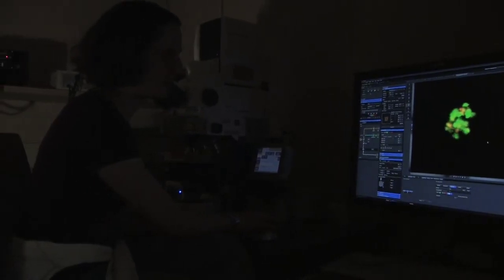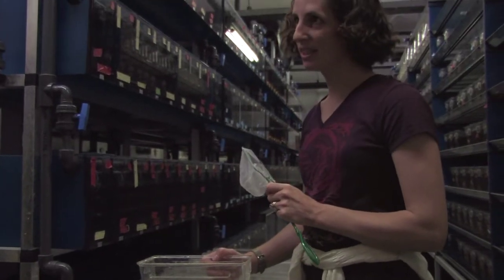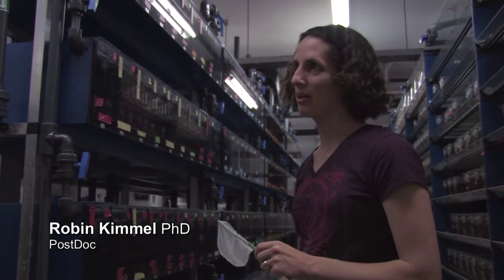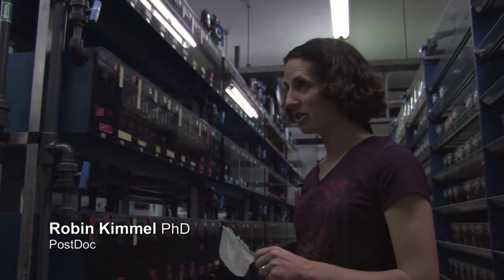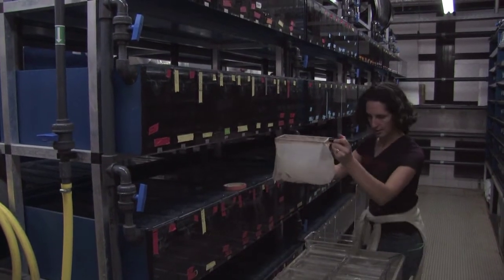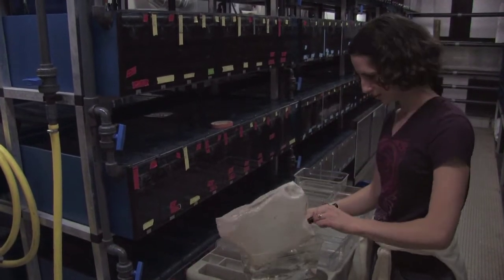These fish have a GFP expressed in the precursors for the beta cells of the pancreas. I want to know which ones are homozygous for the transgene, so I'm going to set them up with wild-type fish. And then when you get embryos the next day, you can see the clutches of embryos where they all have the transgene. That means one of the parents was a homozygote.